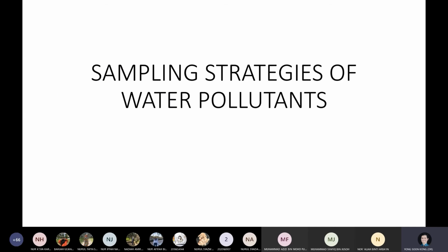Okay. Now, to begin with, I'm going to discuss with you the strategies on how to conduct sampling of surface water. The strategies here depend on what pollutants you're dealing with. That is why at the beginning of this course, I gave you an overview: before you even conduct sampling, it is important for you to plan, because once you have planned, you have an idea what you're dealing with, and then you can prepare accordingly.